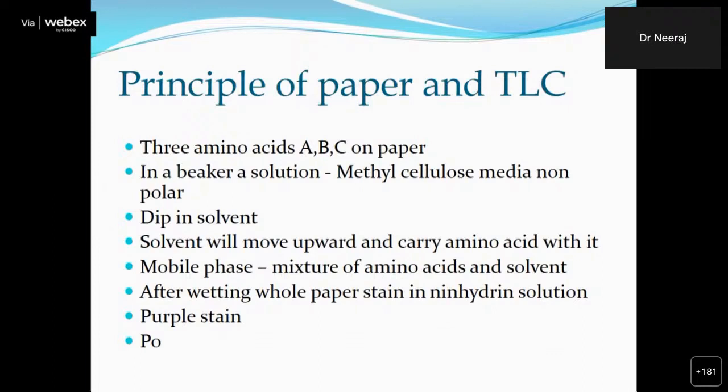Paper is an old version. I have mentioned in my slide earlier that paper is the old version and TLC is the new version. TLC is very costly, but definitely it's very effective. It is mainly used in R&D nowadays. TLC, thin layer chromatography, and HPLC, high pressure liquid chromatography, you have definitely heard of HPLC, are there to extract the components. So this is very important nowadays, and you must know the principles of paper and TLC.